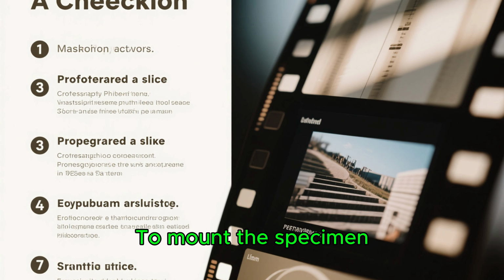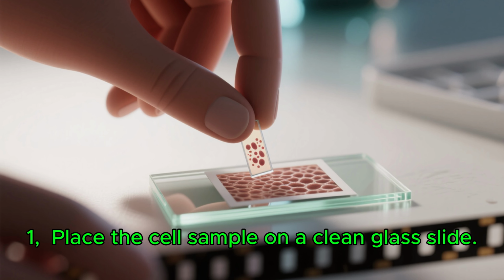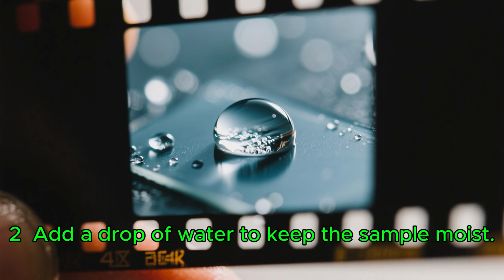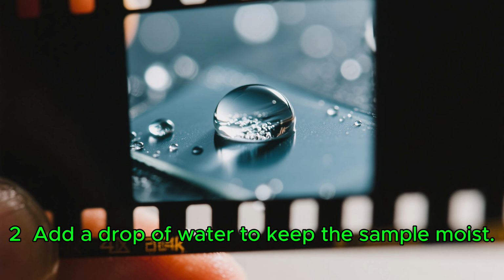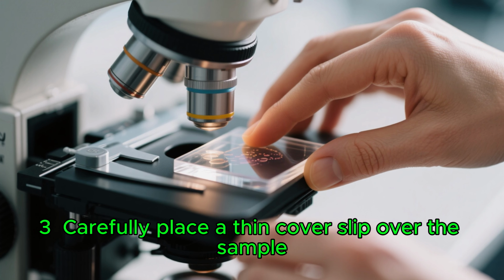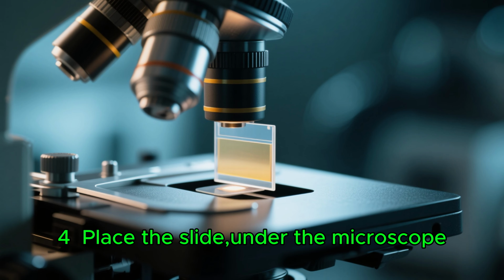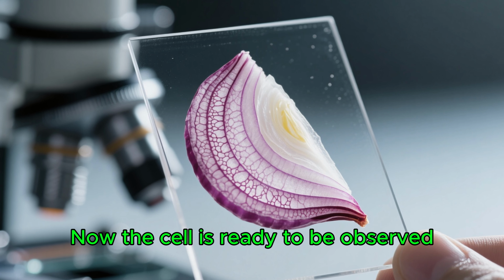To mount the specimen, we follow these steps. 1. Place the cell sample on a clean glass slide. 2. Add a drop of water to keep the sample moist. 3. Carefully place a thin cover slip over the sample. 4. Place the slide under the microscope. Now the cell is ready to be observed.